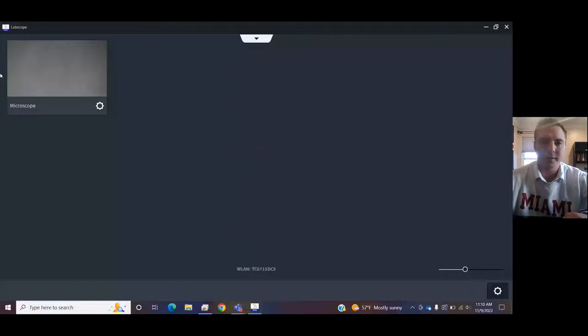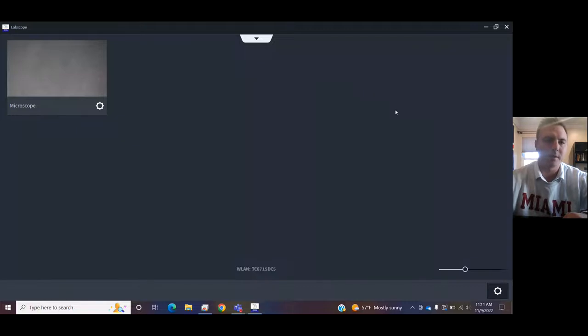Let me share LabScope. One of the most important things is you've got to plug in the camera from the microscope into your computer, simply via USB. Once you've got that plugged in, this is your opening screen for LabScope.